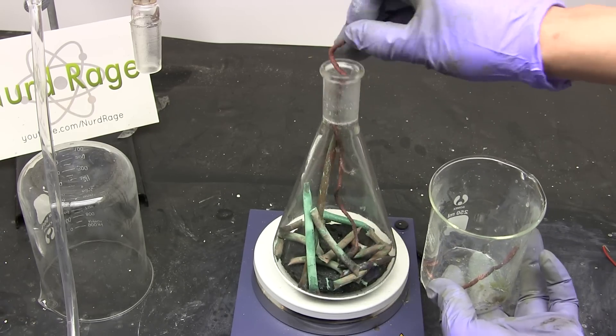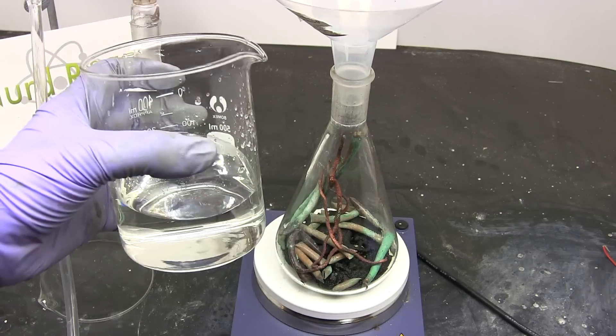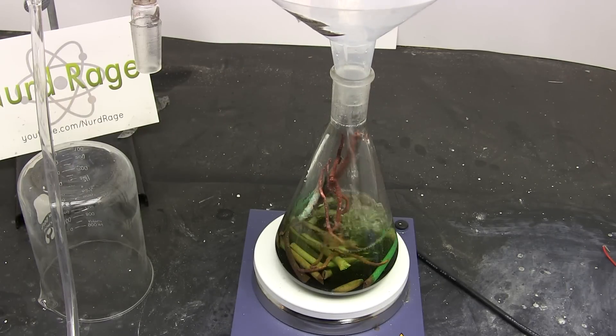I recommend using larger pieces of copper like I am here as it will make it easier to remove the copper later. Now since I distilled out the acid I'm going to add the acid back in.